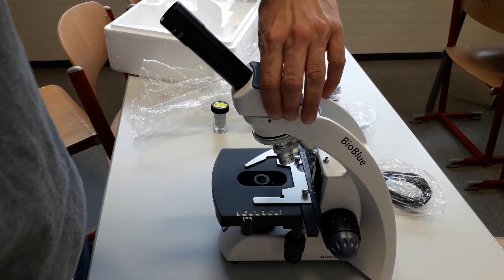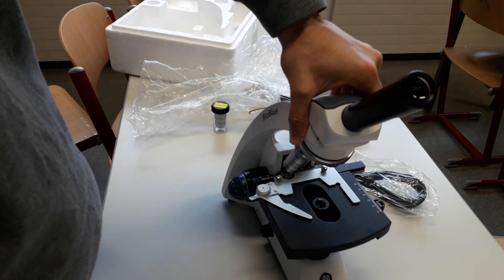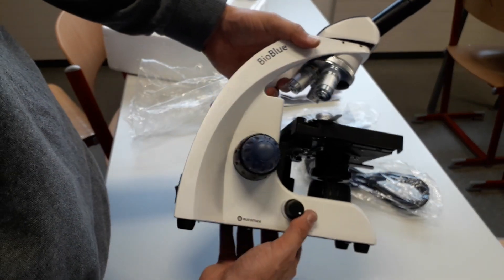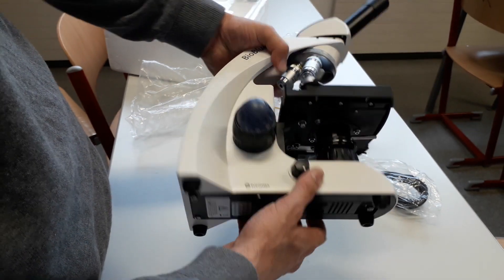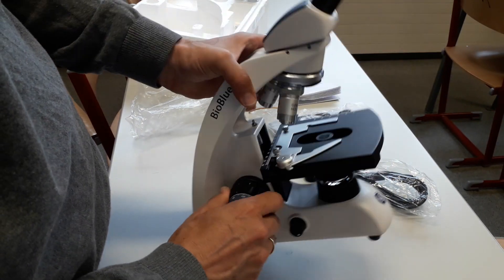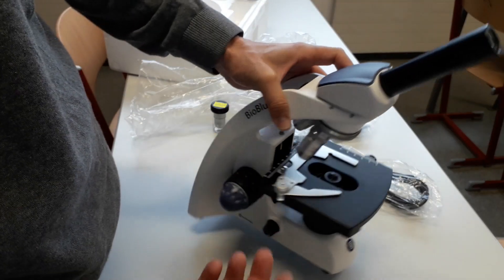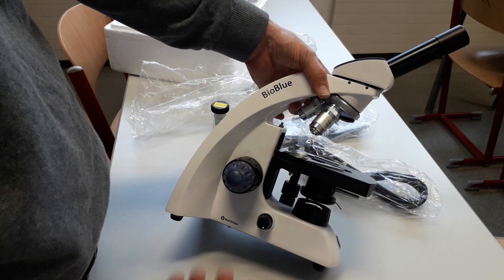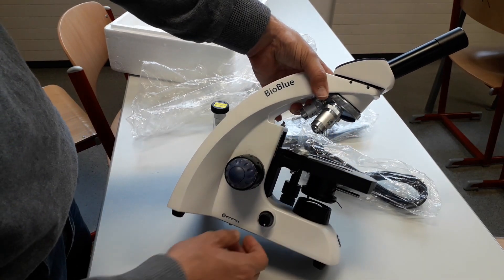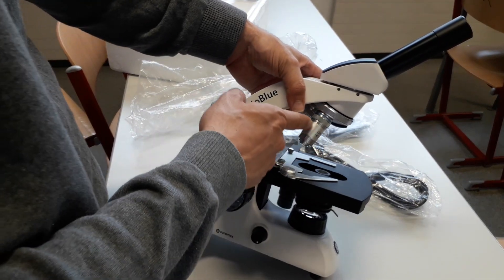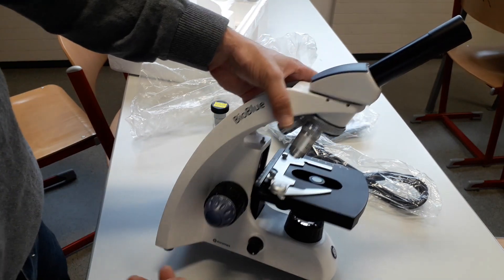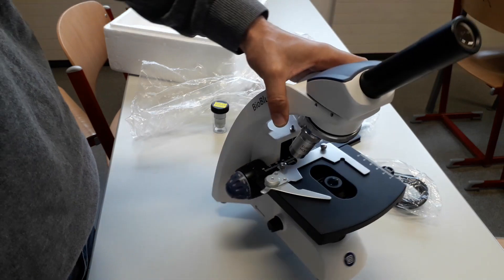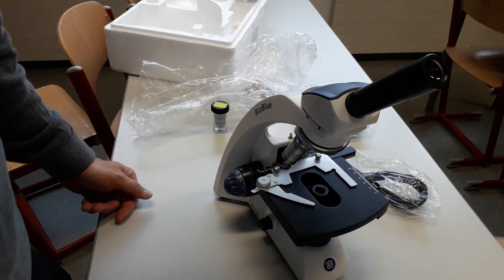And I'm going to now put this one up on display. And then our teachers have to decide whether this is actually one that we want or not. Of course, in fine focus, no, I'm not even going to look through it right now, because I know that the image quality is going to be fine anyway. I know the objectives and I know what to expect. This is, of course, a 160 millimeters DIN, the traditional standard. And it's okay. It's not too heavy. So I'll put this up for display. Now let's have a look at the other microscope.